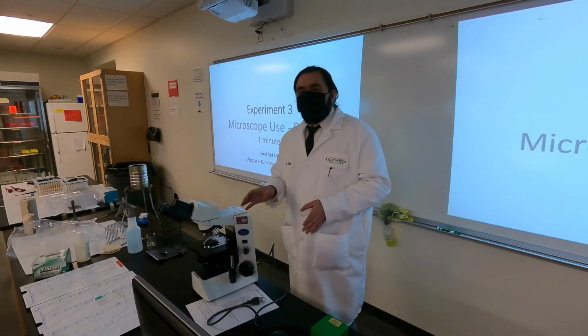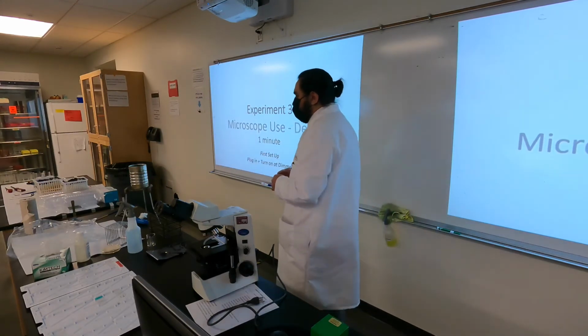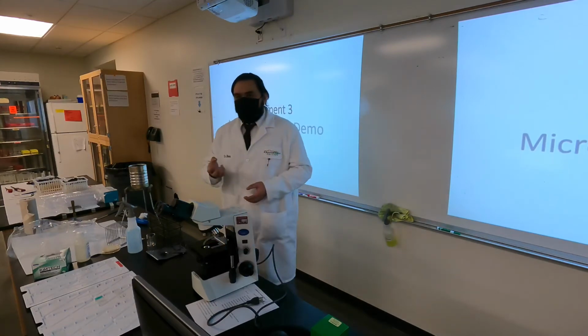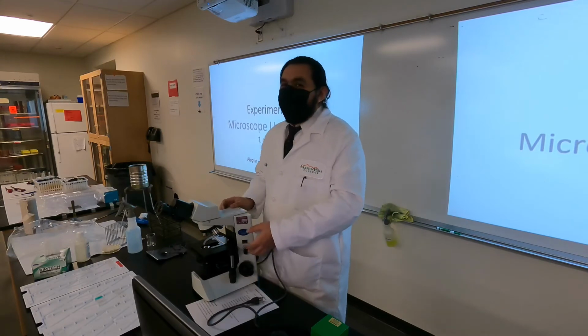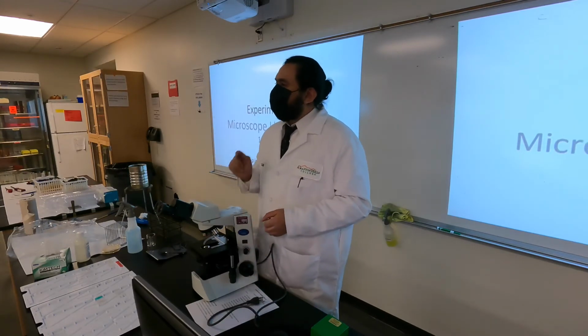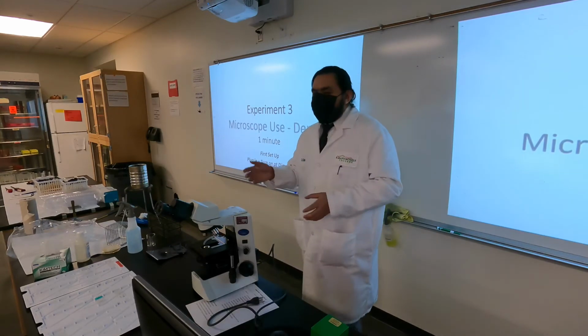Now, quick warning, because this is a wet lab typically, all our light switches are surge protected, which means that if water hits them, they snap off. So in the event that you turn this on and nothing's working, you just have to press the little reset button on the surge switch, okay? So that's it. So let's set these up really quick.